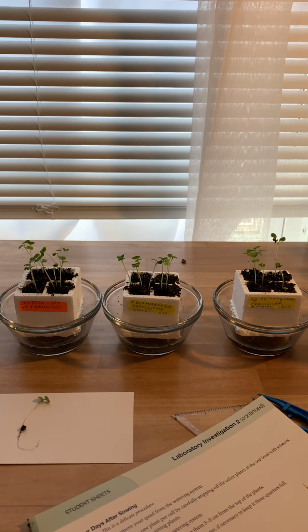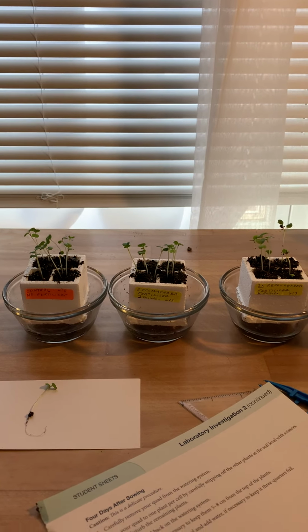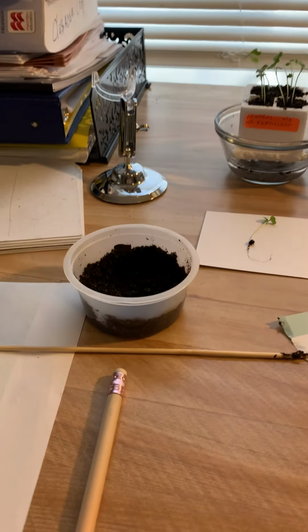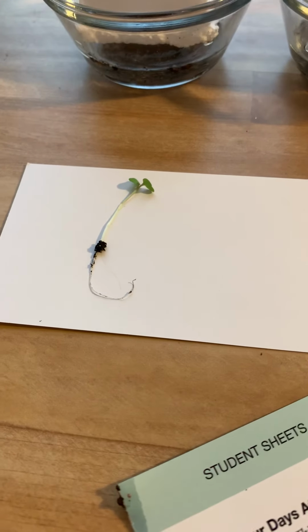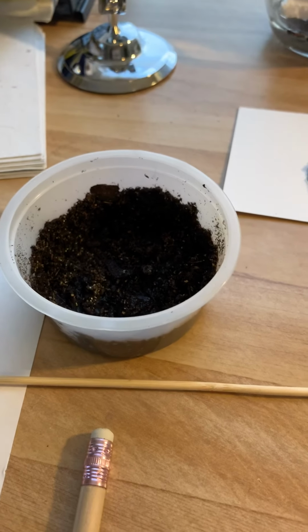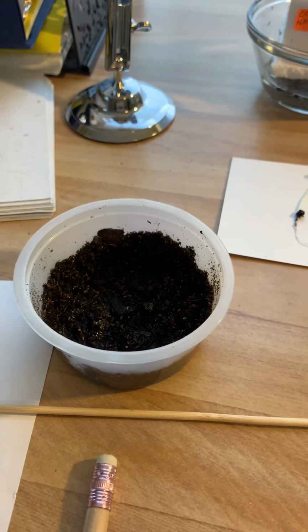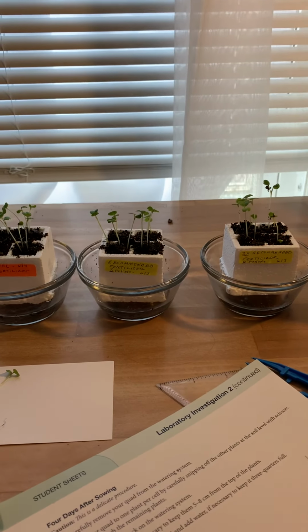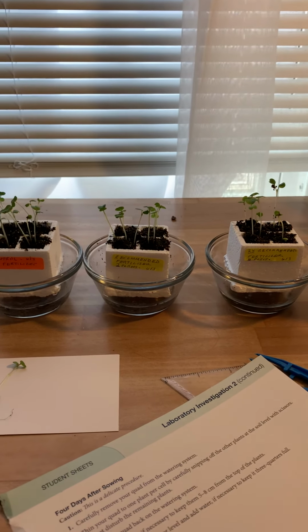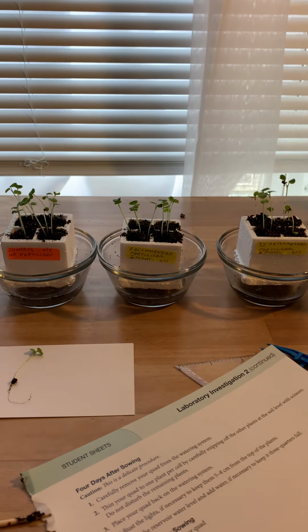I also would suggest that as you carefully pull some of these plants out by the roots, you may want to set up a secondary little pot like this one with some soil and transplant the ones that you pull out into this, just in case you have a lot of mortality, meaning just in case a lot of them die, you may have some additional plants to try to gather some data from. I'm going to go ahead and stop this video and get set up to show you how to actually remove the plants.